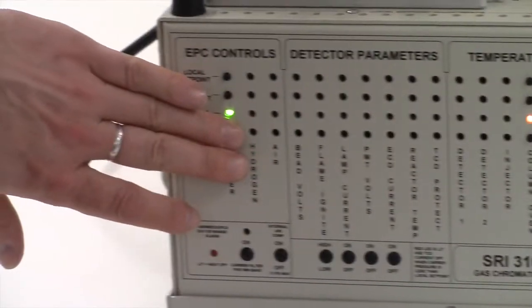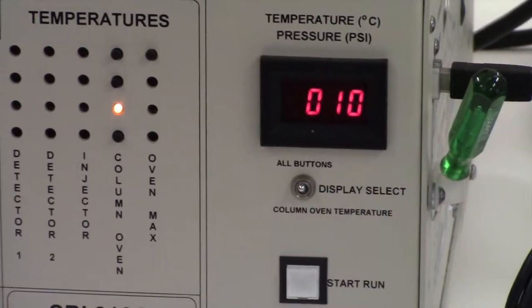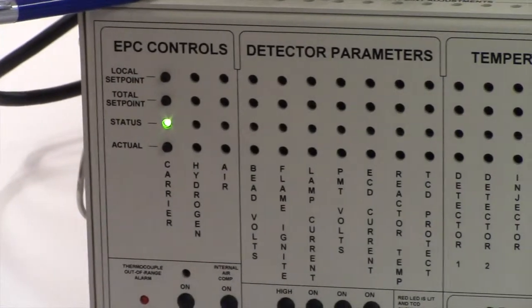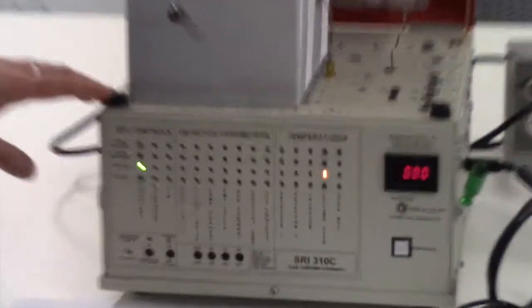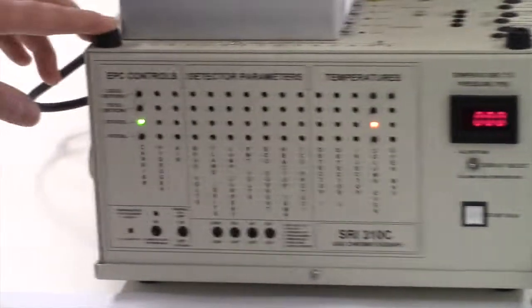We can see the actual flow 10. The setting 10 roughly corresponds to about 20 milliliters per minute, and it is an adjustable setting, which can be tweaked with the trimmer right there. So we have total set point and local set point, which are the same, so there is no offsetting.